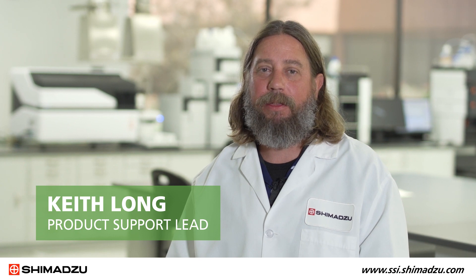Hi, my name is Keith Long and I'm a product support lead at Shimadzu Scientific Instruments working with our elemental spectroscopy instruments. In this video, I will demonstrate how to replace a combustion tube and O-rings in a TOC-LC combustion style instrument.